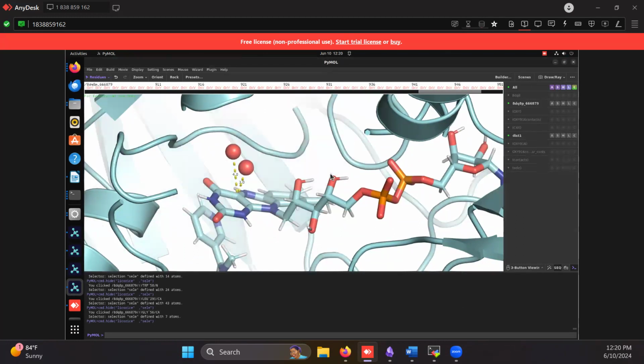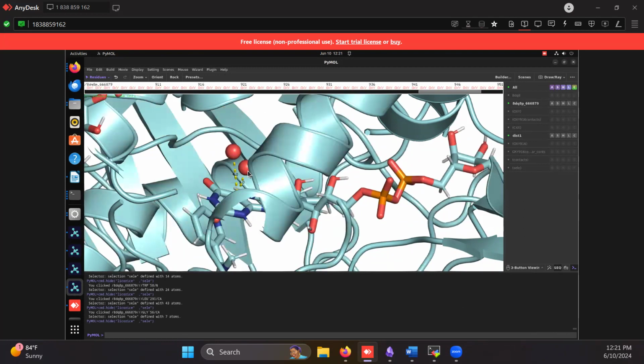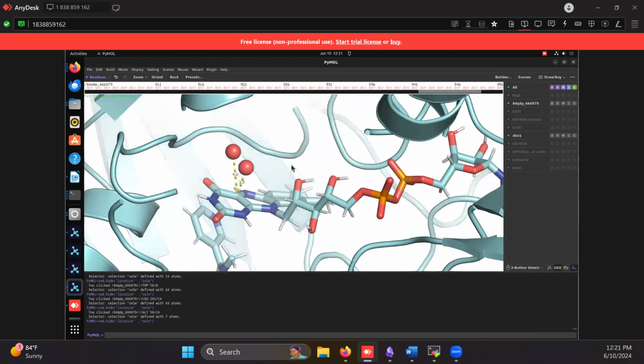It's the same ligand and same protein, but I've gone through and changed all the residues, all the cartoon representations, which I thought were getting in the way. I'll show you how it looks fully scrolled up. I scrolled down, got a place where I think most of the cartoon representations are not there, and hid parts which are overlapping with my ligand. In this representation, I want to show how close this oxygen molecule is to a particular part of my ligand.